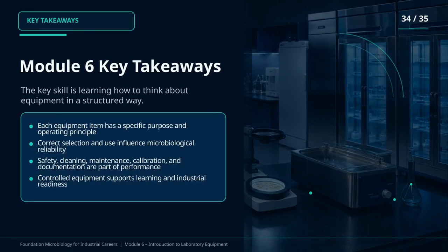Correct selection, safe use, cleaning, maintenance, calibration, and documentation directly influence microbiological reliability and future industrial readiness.